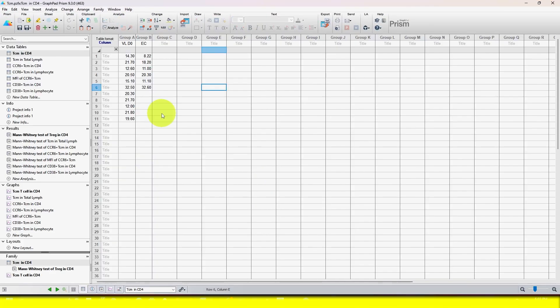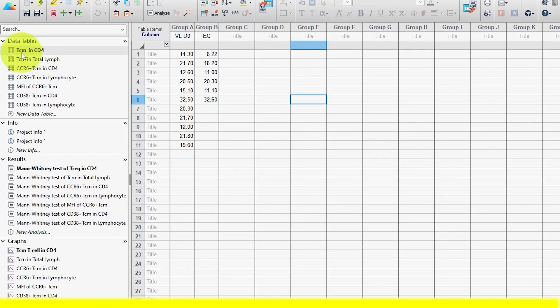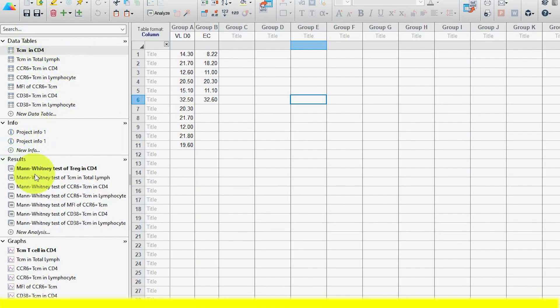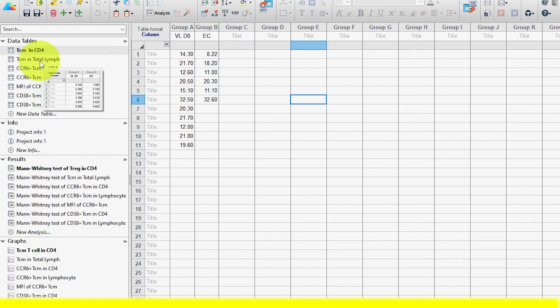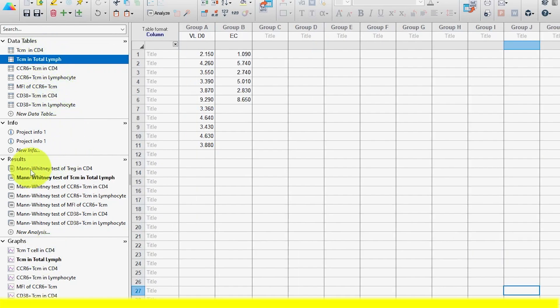Here you can see on my screen, I have a Prism file in which you can see at the left side the data table. I have 7 files and also the associated result and graph files. If you notice, file 1 in the data table is highlighted, and likewise the result and graph files are highlighted. And if you select the second file in the data table, you can see the associated file highlighted in the result and graph section.